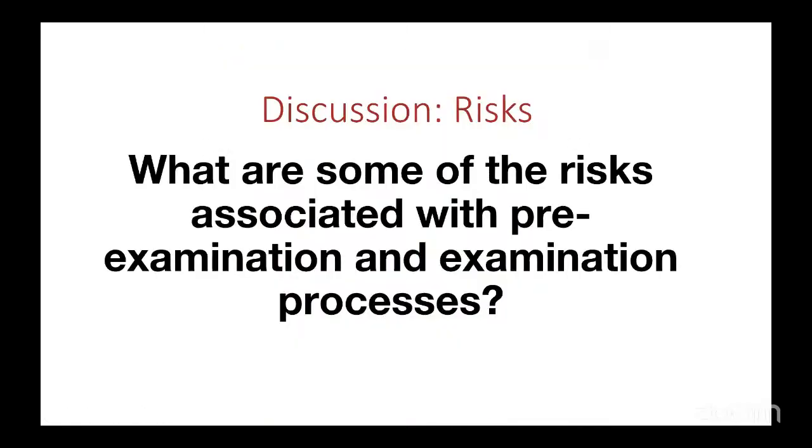So, what are some of the risks associated with pre-examination and examination processes? Ask yourself, just write it down. What are some of the risks associated with the pre-examination and examination processes, all the processes within the lab? You know, we have the pre-analytical, analytical, and the post-analytical. So, what are some of the risks associated with the pre-examination and the examination processes within the lab?